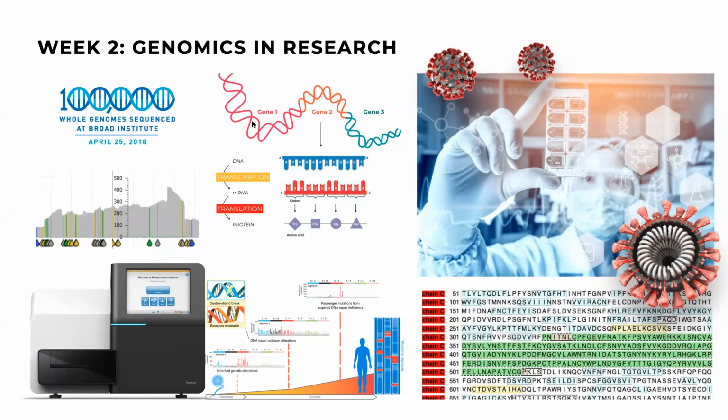We'll talk about how those mutations that you found can be categorized. How do we actually categorize those mutations? And how do we use next generation sequencing to study outbreaks of viral pandemics or viral diseases? And we'll also talk about an introduction to metagenomics in general. What is metagenomics and how does it work in terms of next generation sequencing data analysis?